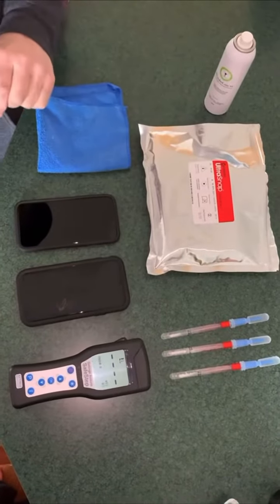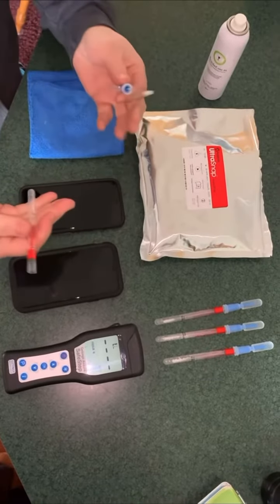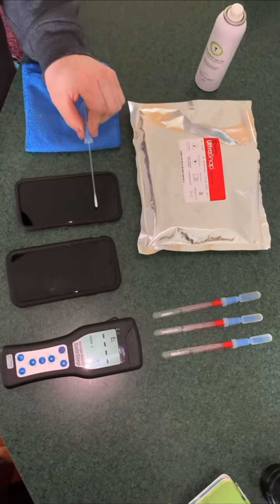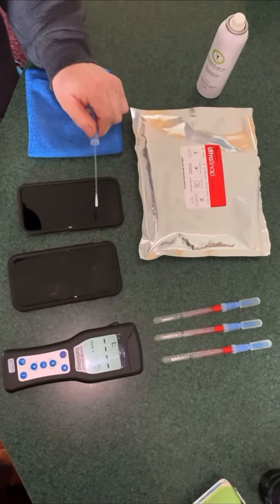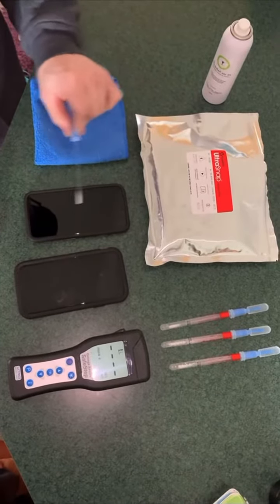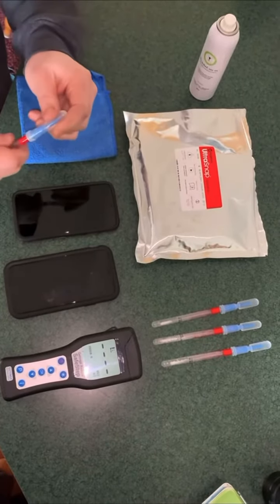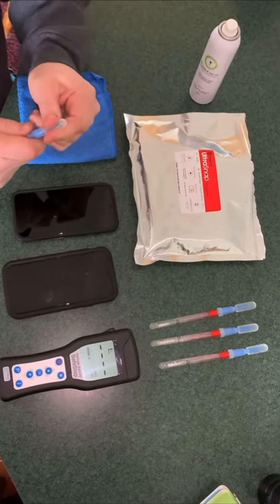I'm going to do a video demonstrating how you test a treated antimicrobial surface using an ATP meter. I've done this numerous times at healthcare for design shows and infection control shows, national ones. So this is my phone — I treated it right after I bought it with MicrobeCare.